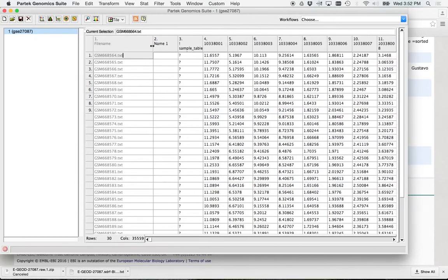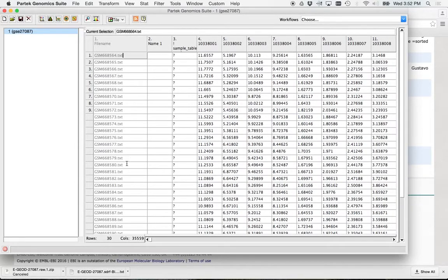Our file. These are the identifiers for those samples on this column. Here are our genes. This is the Affymetrix identification. If you went to Affymetrix and looked up this identifier for this chip, you could figure out what gene that is. We are going to tell the software what this is. Don't worry about that.